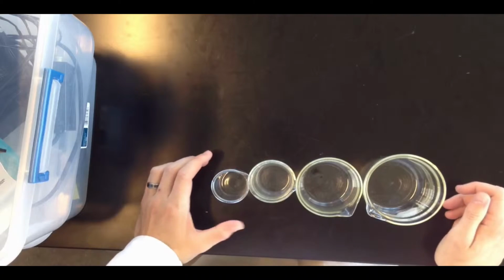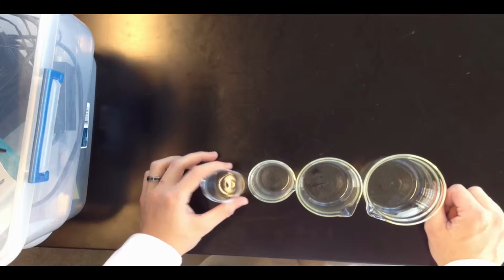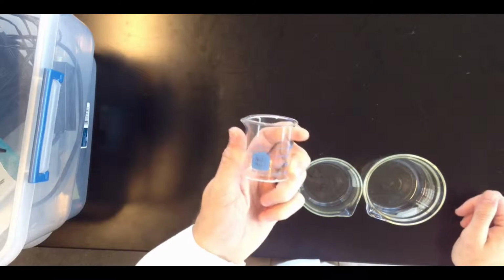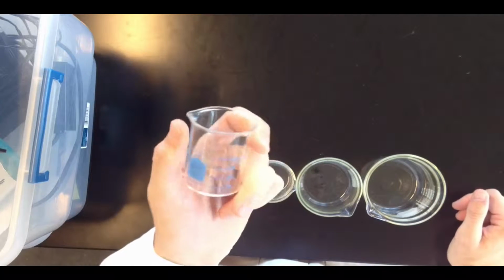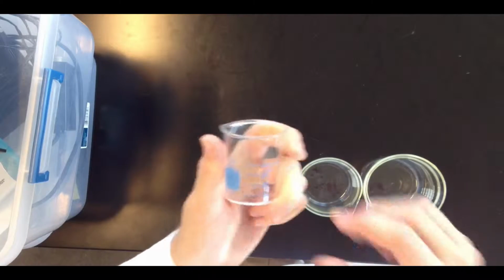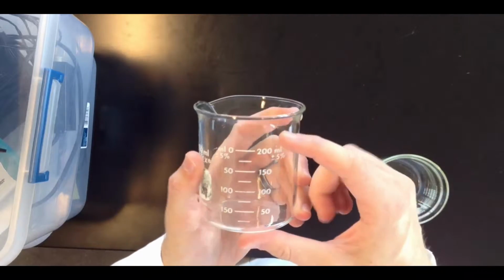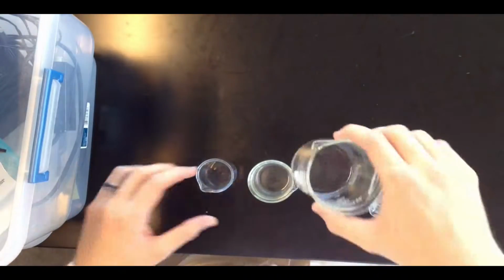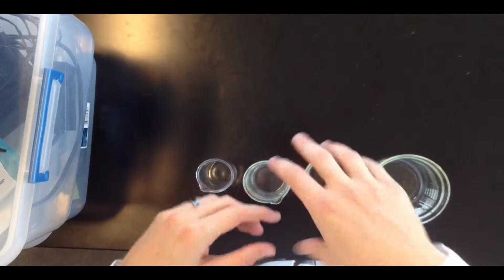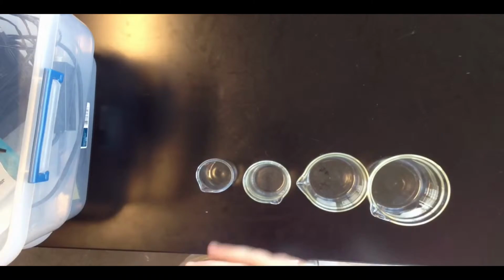Let's get a feel for some of the more common glassware you'll be using in the laboratory. So first of all, we have here the beakers, and beakers are generally just to contain rather than to measure or deliver the volume of liquid. So you'll see volumetric markings on beakers, but these are approximate at best. They can give you a feel of where your liquid volume is, but they shouldn't be used for measuring or deliver liquids. We'll use them most often to run reactions and in some cases contain or store solutions.